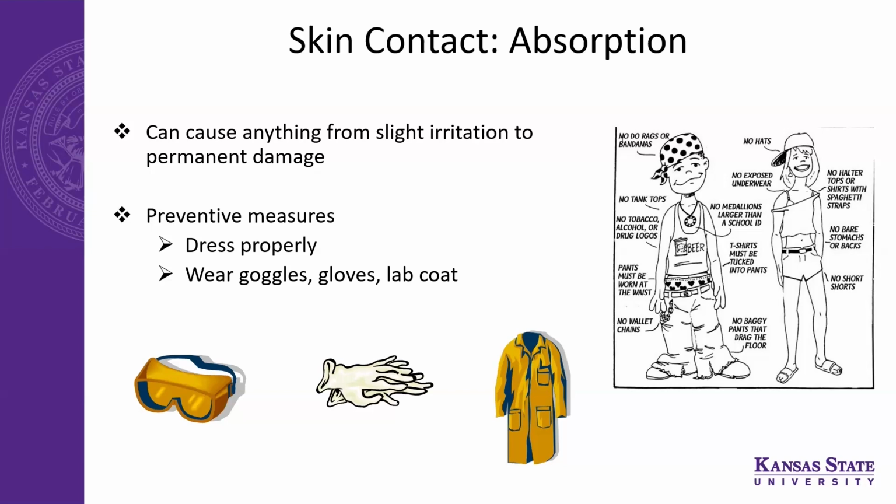Depending, again, on the lab, we have some dry labs. If there are no chemicals, we'll use common sense in that case. For example, last week, we did not use any wet chemistry in our Chem 1 lab. It was like building models and stuff. For that, we can let them in because there are no chemicals. But for example, we have a lab where we use sodium chloride, which is table salt, right? Although we will not be using hazardous chemicals, we still can have broken glass.